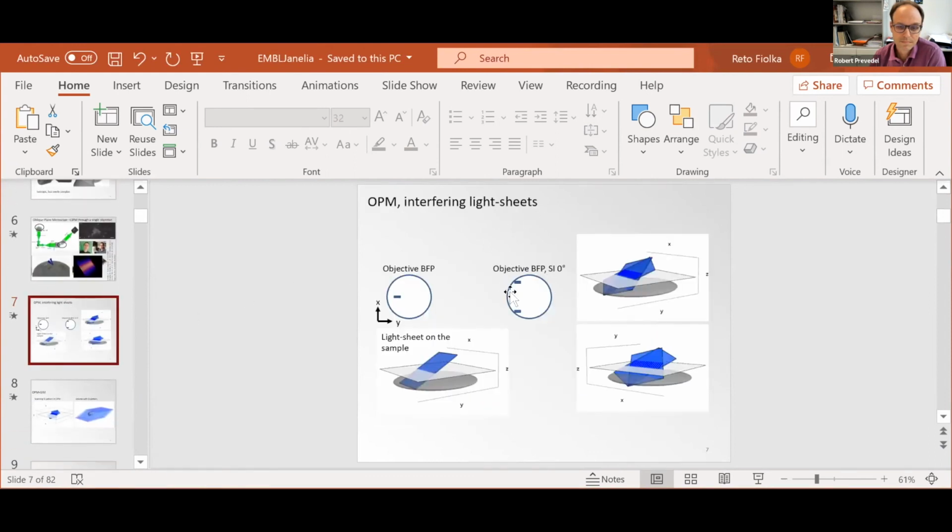The additional dimension, let's call it KY, you cannot go symmetrically, plus and minus, to for example create something like a hexagonal lattice. Its aspect ratio would be different because here you simply lack space. You can go further out here to create the lateral pattern, but less in the other direction. But still, you could gain something. My guess is that the gain would still be less than what you could get in a 3D SIM.